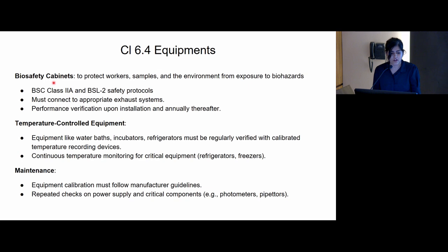All labs should also have biosafety cabinets, which are important to protect workers, samples, and the working environment from exposure to biohazards. Our lab uses biosafety cabinets class 2A and biosafety level 2 safety protocols to ensure the safety of workers, samples, and environment. All performance verification of biosafety cabinets should be done upon installation as well as annually thereafter.